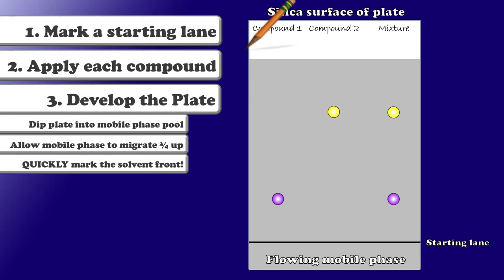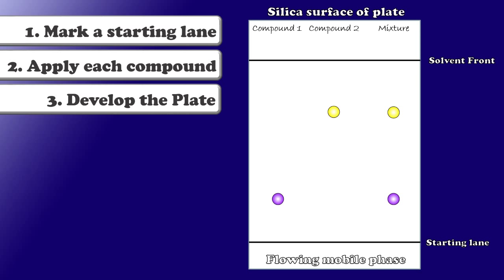At this point, my plate has finished developing. I have to quickly mark that solvent front because if I don't mark it rapidly, that solvent will eventually evaporate and it's very difficult to detect where it was at all. So now I have a developed TLC plate. And I can clearly see that my yellow compound has moved farther than my purple compound. So my yellow compound must be less polar.